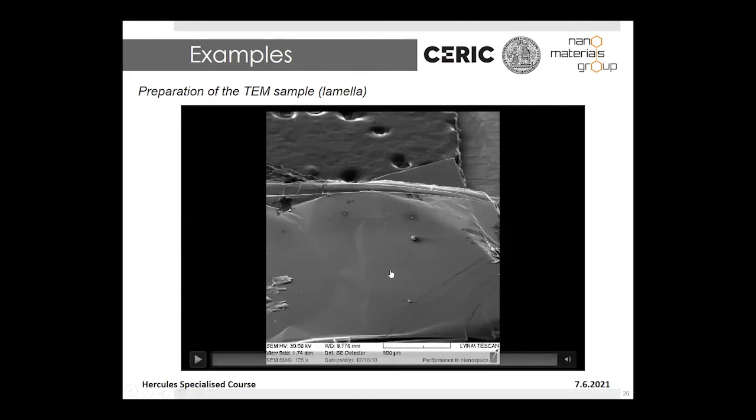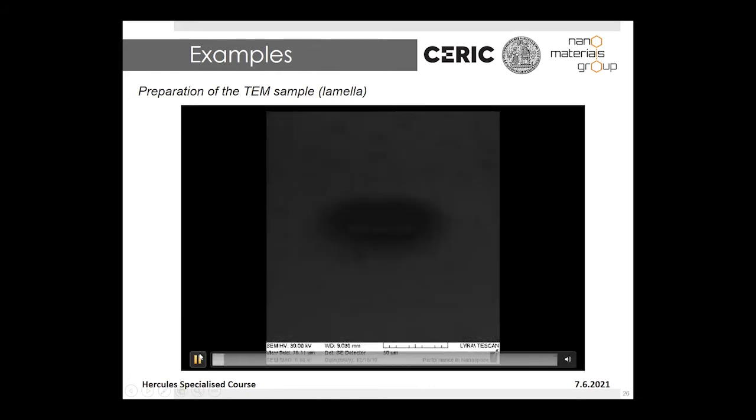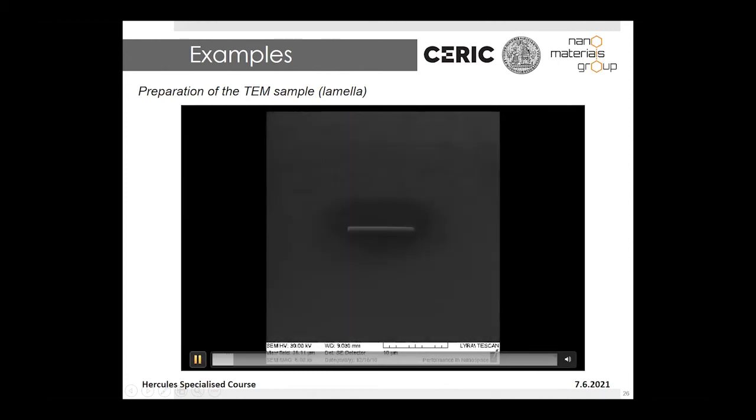So this is your surface, your sample. Not possible to stop it. Wait a minute. I will go through the process faster, and then I will show it to you one more time. So here we have this gas nozzle.